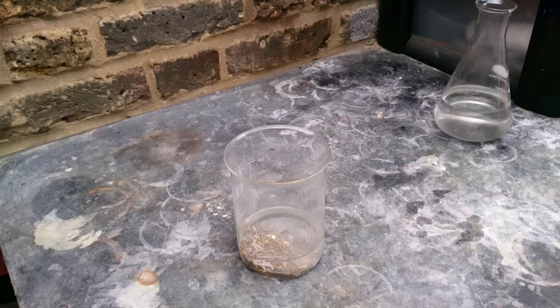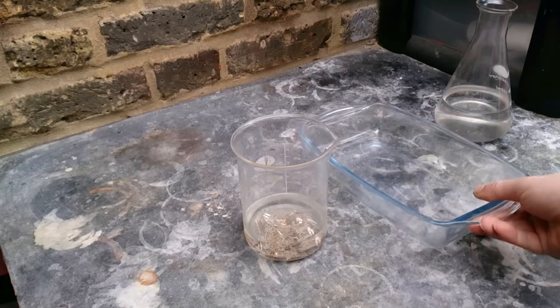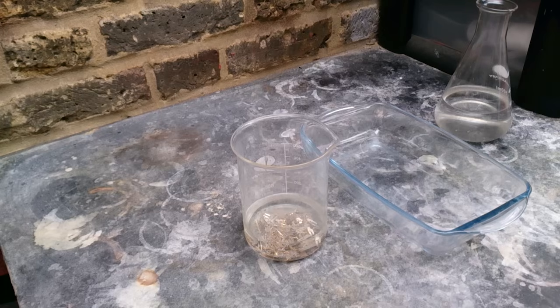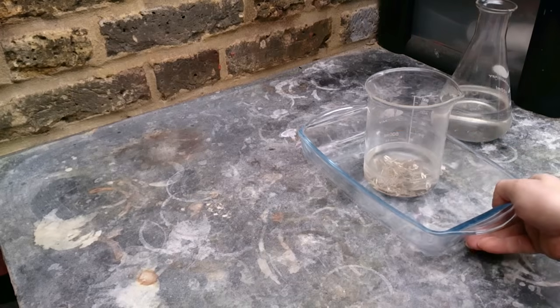Depending on the alloys used in the contacts, almost immediately you will see some bubbling. It is also a good thing to have a plan B whenever you work with hydrogen peroxide. In case it boils over, everything will be collected in this borosilicate tray.